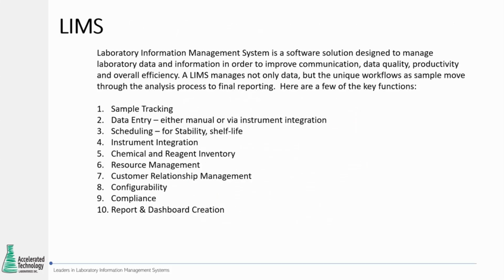Next, let's take a look at LIMS. LIMS is an acronym for Laboratory Information Management Systems. It's basically a software solution designed to manage all aspects of laboratory operations. And it all begins with sample tracking, accessioning samples, receiving them into the laboratory, and taking custody of those samples.